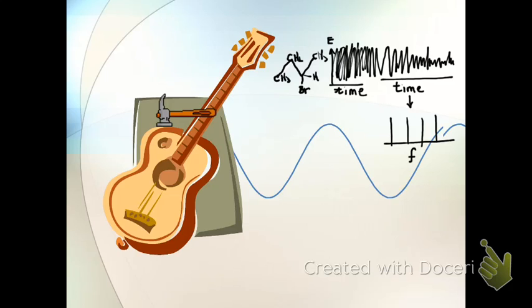In the frequency domain, that's what we call our NMR spectrum. Now, to simplify this whole thing, we typically convert that frequency domain into a unit called parts per million.